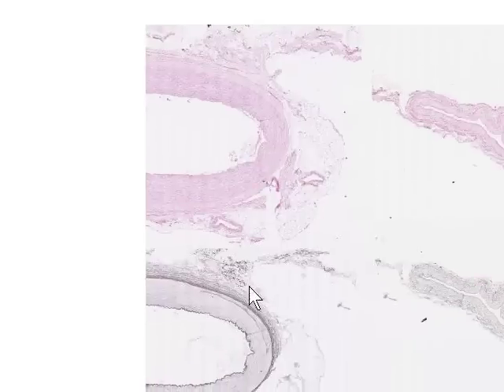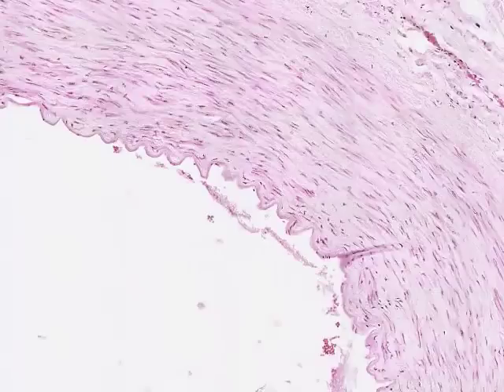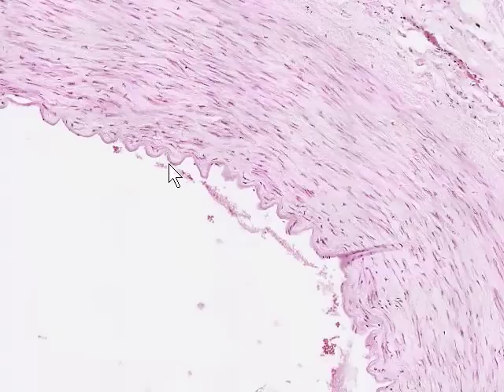So let's first look at higher magnification at the structure of the muscular artery. Here's the muscular artery at a slightly higher magnification. The endothelial cells that line the luminal surface lie along here, and we can see occasional nuclei, very dark dot-staining things, which belong to these endothelial cells. The tunica intima is thin, and here is represented by the mauve staining area immediately beneath the endothelium.